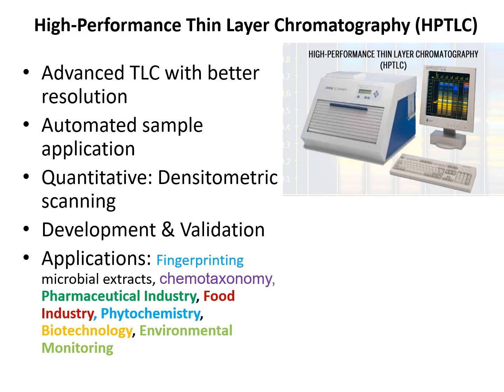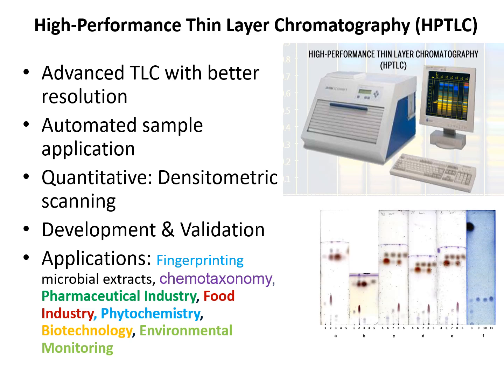TLC, because it separates compounds based on their physical and chemical properties, is able to produce a unique pattern called fingerprint that can be compared between samples.